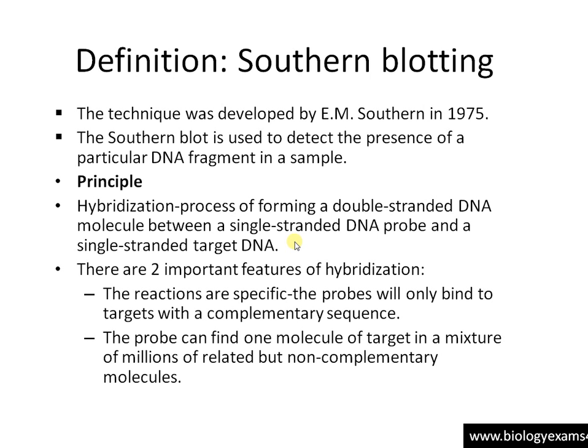The two important aspects of hybridization are that the reaction is highly specific, and the probe will only bind to the complementary sequence. Second, even if there are millions of DNA molecules there, the probe is capable of finding our target DNA.